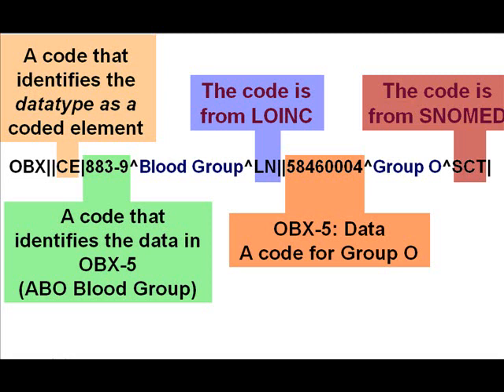So the ideal situation is that there's one common LOINC identifier for all tests that are really the same test clinically. And there's a little bit of fuzziness around that, but what it means is something that can be used in identically the same way for patient decision making or for tracking the patient.